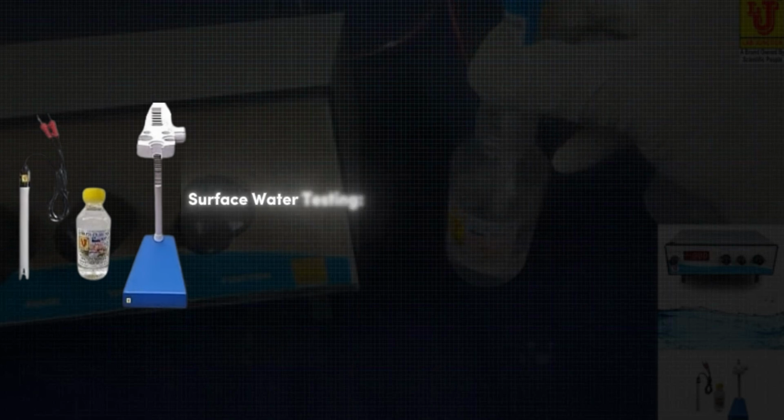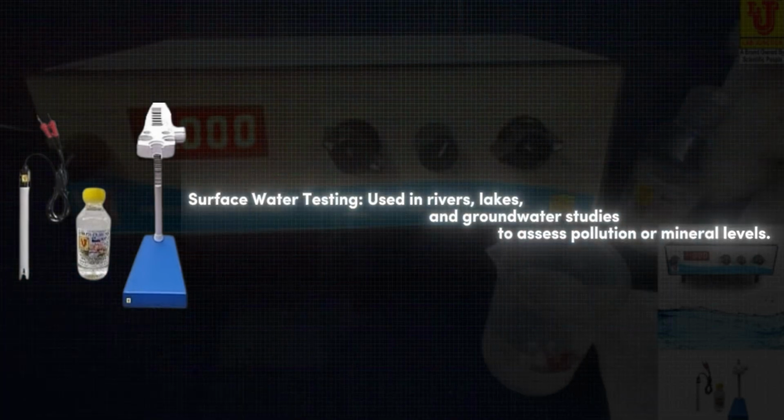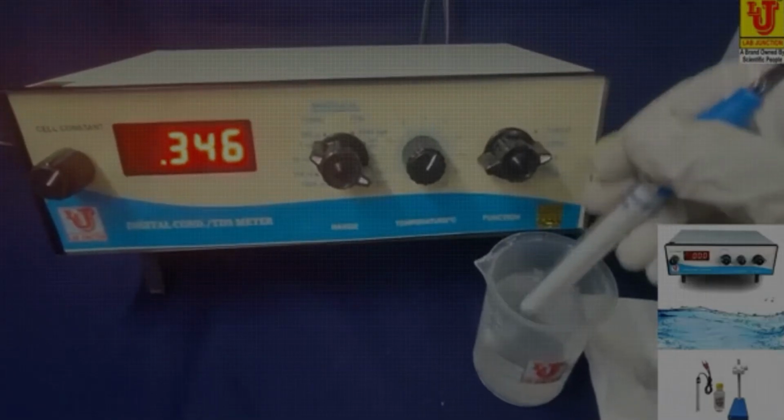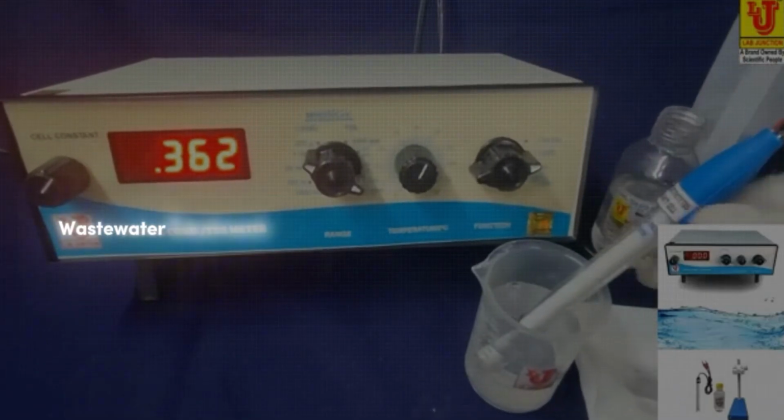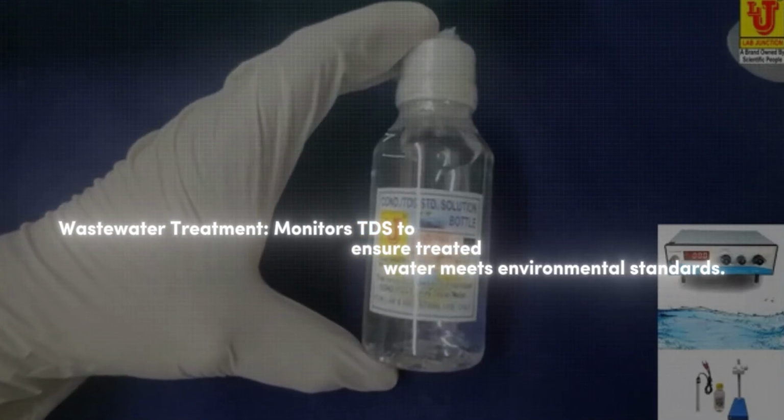Surface water testing: used in rivers, lakes, and groundwater studies to assess pollution or mineral levels. Wastewater treatment: monitors TDS to ensure treated water meets environmental standards.